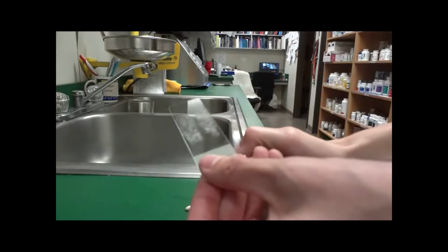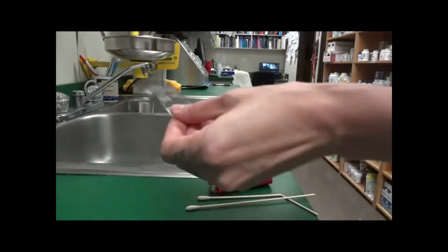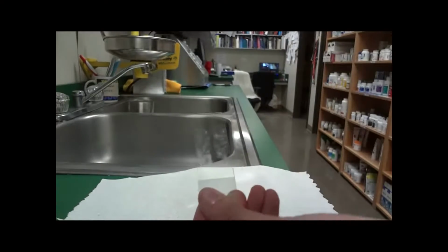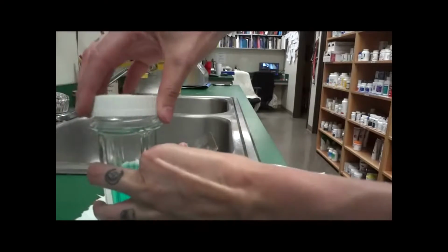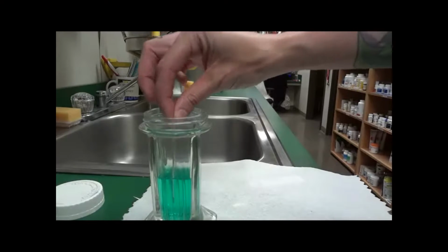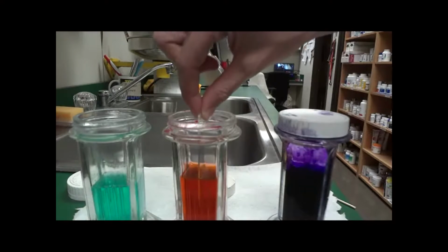Then we'll briefly heat fix it. Clean off the bottom of the slide. Apply it directly into our first jar, which is the fixative, for 15 seconds. Alright, we're going to transfer our slide to the second jar, which is a stain.